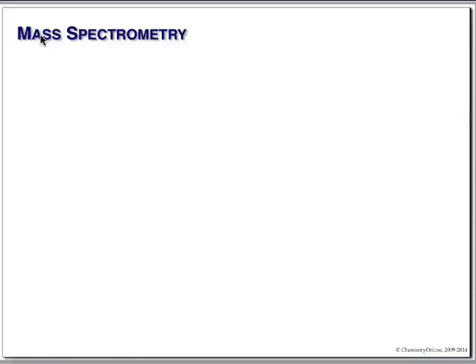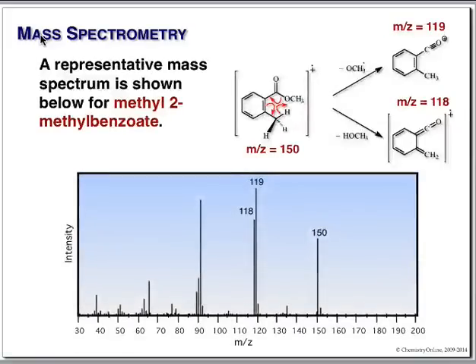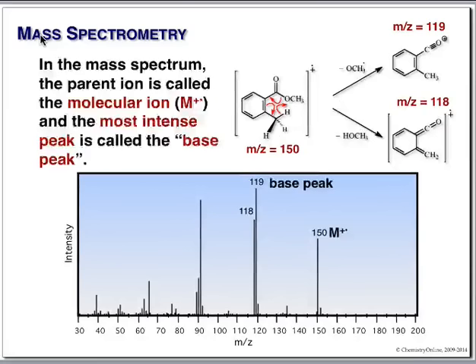Now for the compound we just looked at, our molecular weight is 150. This is our molecular ion here at 150. Our next peak is the highest peak in the spectrum. That's always called the base peak. And actually what you do is you set this to 100% when you do your scaling.